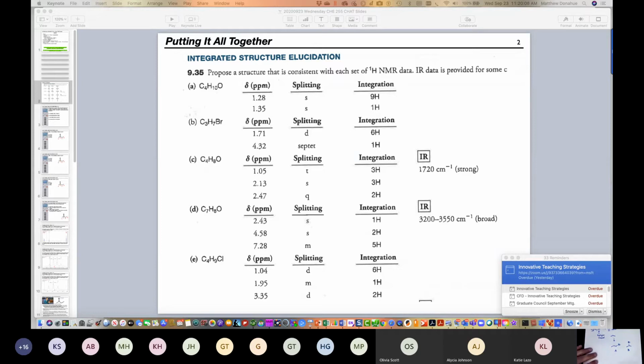So we're getting a lot of B as in boy responses, and how did we arrive at that? Well, if you look here, A has 1, 2, 3 unique sets of hydrogen in a 2 to 2 to 3 ratio. B has 1, those are the same, that's 1, that's 2. So 2 unique hydrogen sets, and the ratio is 3 to 6. And that's what you're seeing for the integration, right?